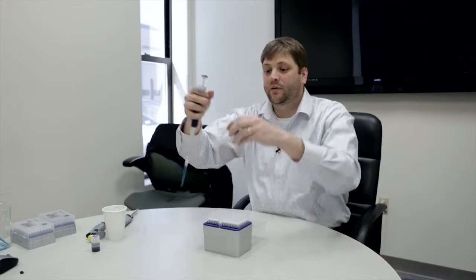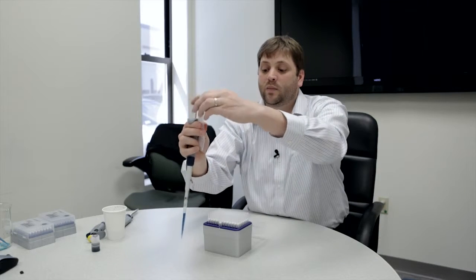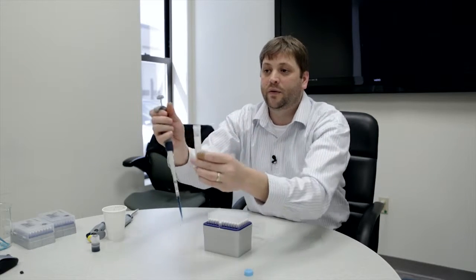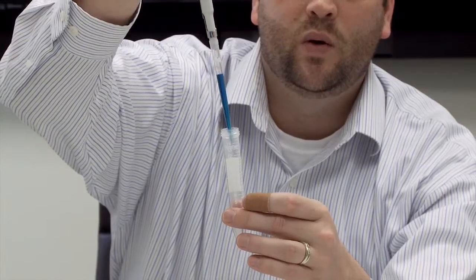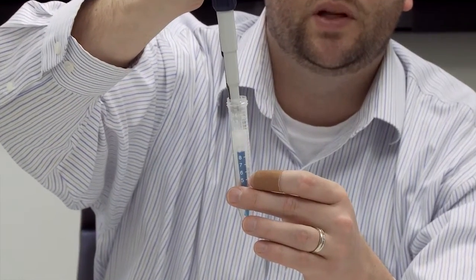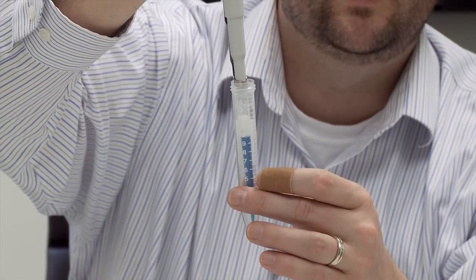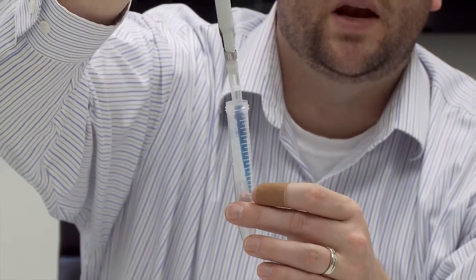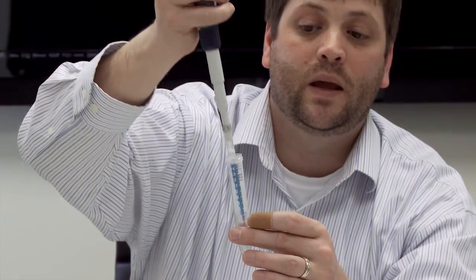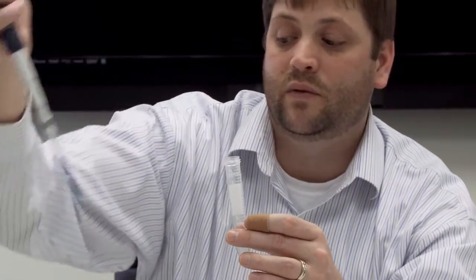The final benefit to using an extra long 1 mil tip is if you're working in 15 mil conical tubes, when you're delivering your sample to the bottom, you don't have to put that much of your pipette shaft into the tube itself. A standard 1 mil, you'll put it over halfway down. Another very big benefit to using Denville.